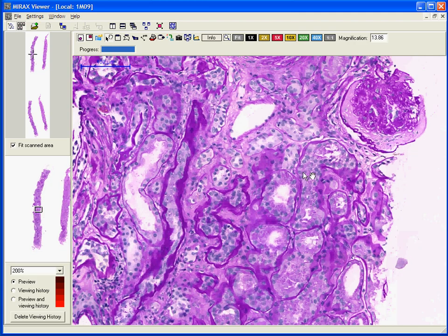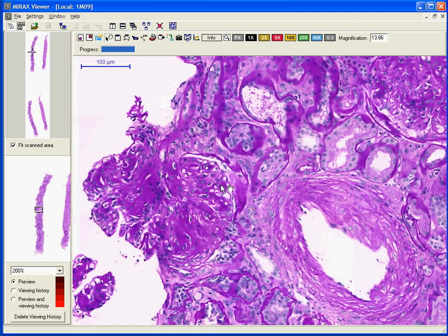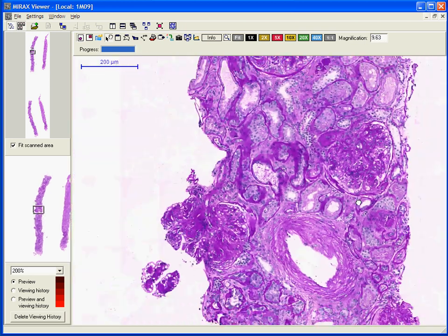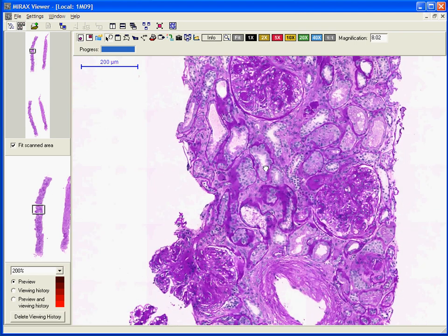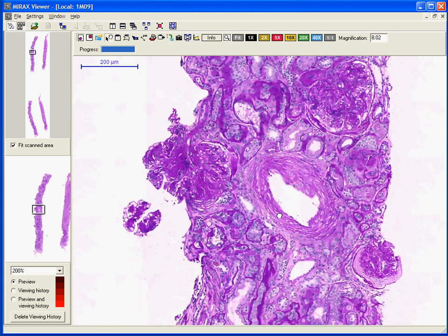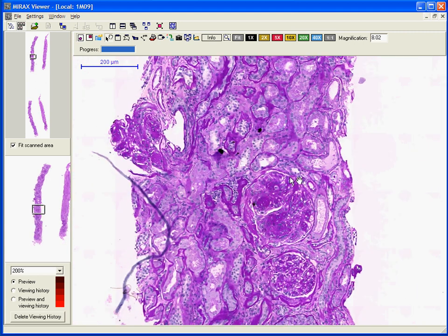Another feature that can be observed is the thickening of the glomerular basement membrane. Also, the size of these glomeruli is somewhat increased, most likely due to the hyperfiltration and increased capillary pressure that is observed in the kidneys.